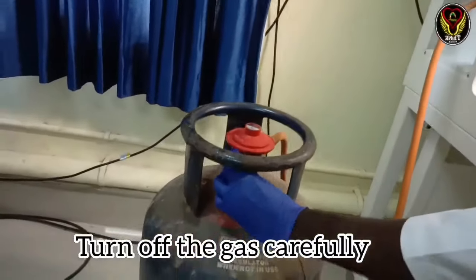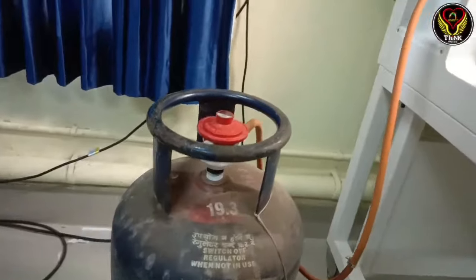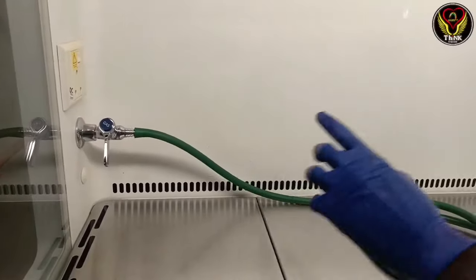There is a proper procedure when turning off the gas. First, we have to turn off the gas tap. Then we will turn off the bunsen burner.